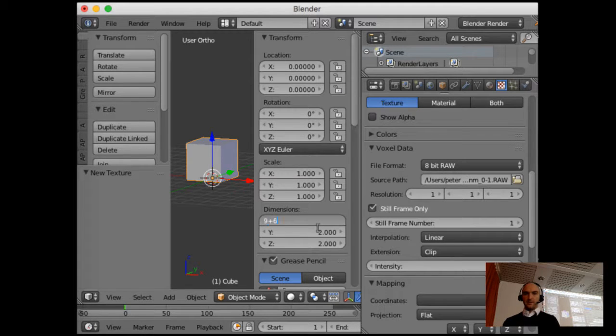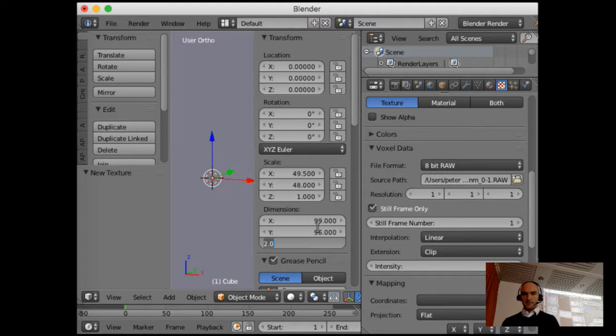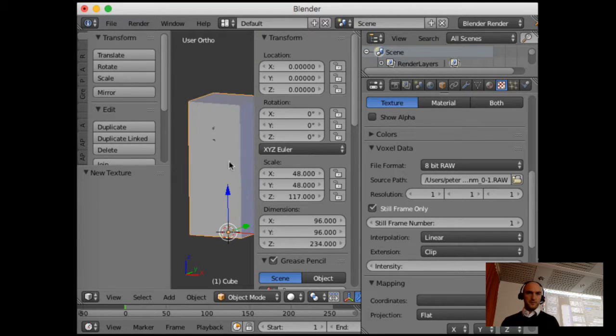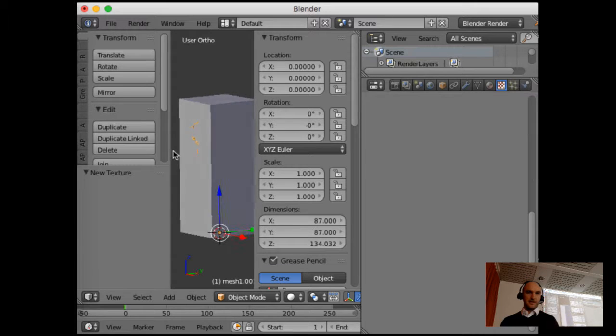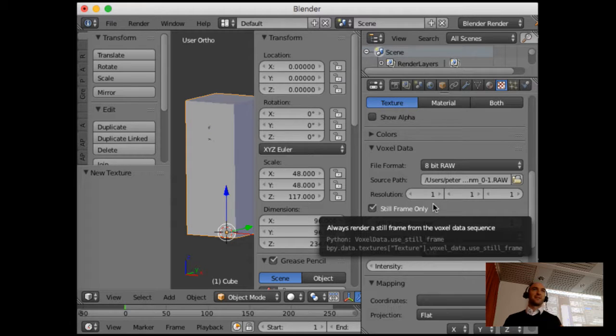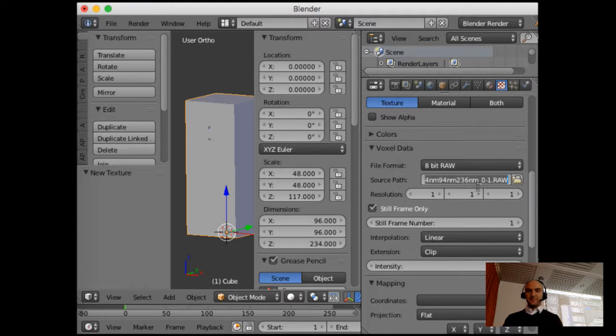Dimensions, what is 96? 96, right? 96 times 230. 96, sorry, times 96. Just zoom out, and there we've got the precipitate in there, and hopefully our volume data will look okay with the precipitate. No, it won't, because that's from last week, so it's still got the XY shift. Anyway, I'll finish it.